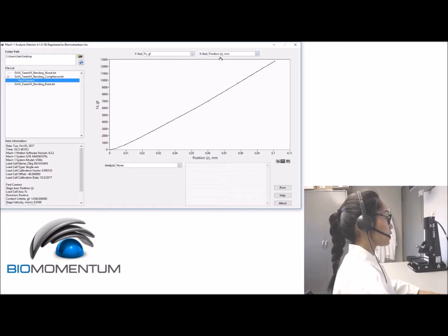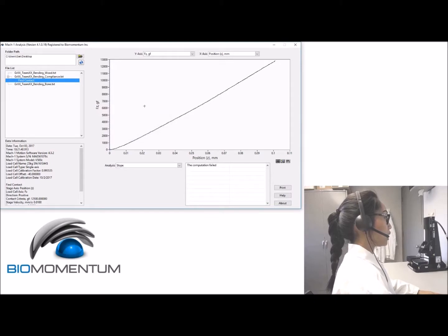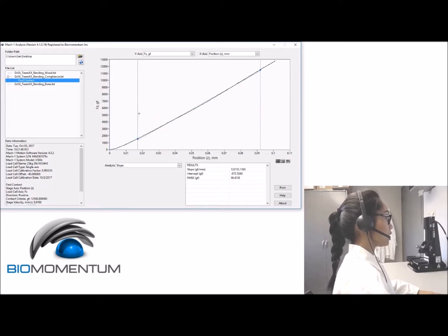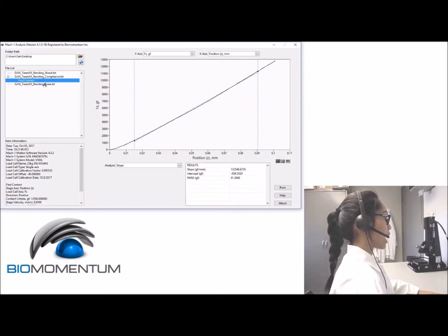From the analysis drop-down menu list, select 'Slope.' Now drag the cursors in the region of interest — the region within the sample's load range — and report the measured slope as the setup compliance slope. Then we will analyze the bending test of the wood.